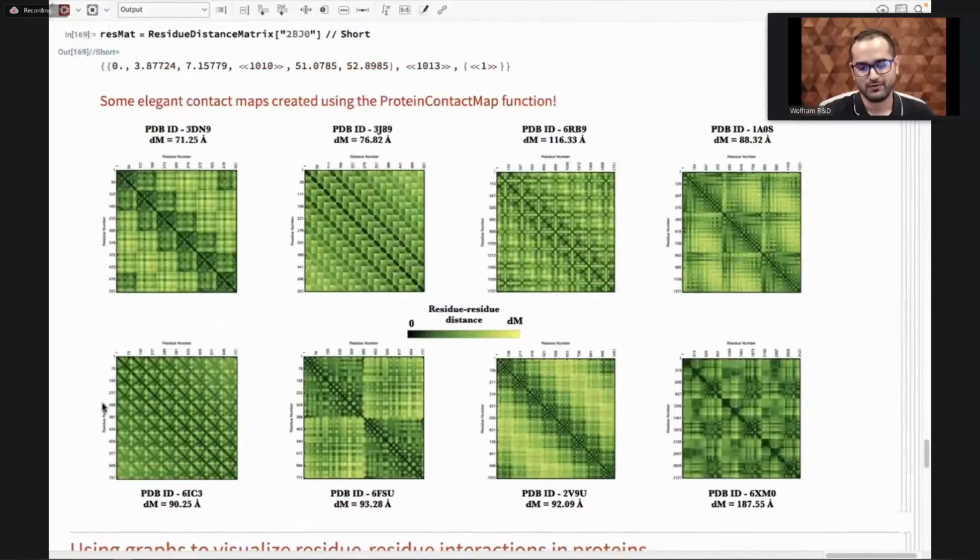So contact maps are a standard and a great way to visualize residue distances in proteins. But I did want to highlight a specific feature that contact maps for large proteins often miss. If you want to see what residues are important in terms of interchain interactions, it might be hard to point out from here because for large proteins it's very difficult.